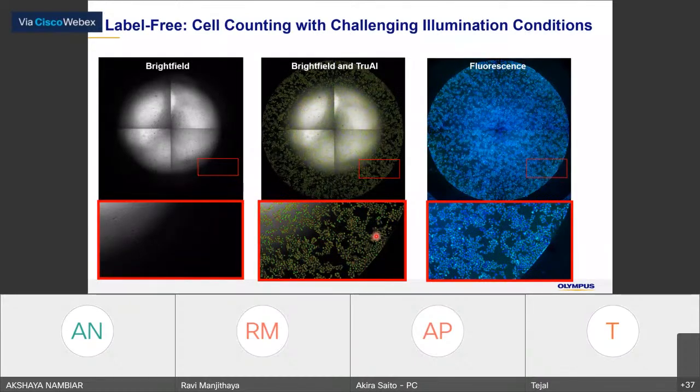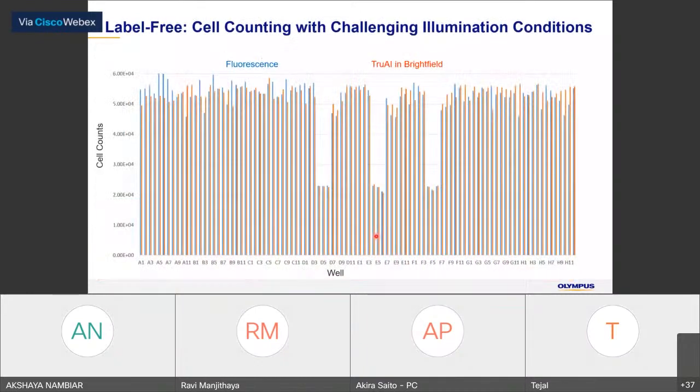So there is a very low contrast over here, but it will be detected even with the bright field image by using the neural network, deep learning. And sorry, True AI is our name for the deep learning technology. But anyway, when we compare the fluorescence nuclear counts and the deep learning results, just with the bright field, it is almost matched to what we can detect with the fluorescence.